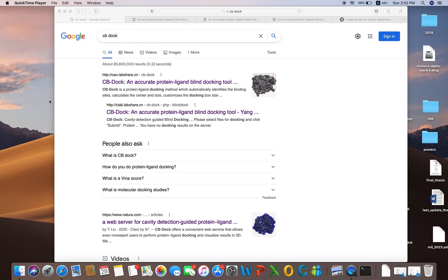The software which we are using today is very important and very accurately reported in Nature as well. That software uses the cavities of the protein, and in different cavities it tries to dock the ligand, and accordingly it ranks the complexes according to the score and other features as well.